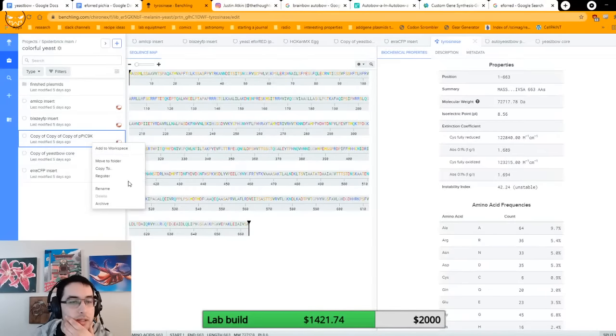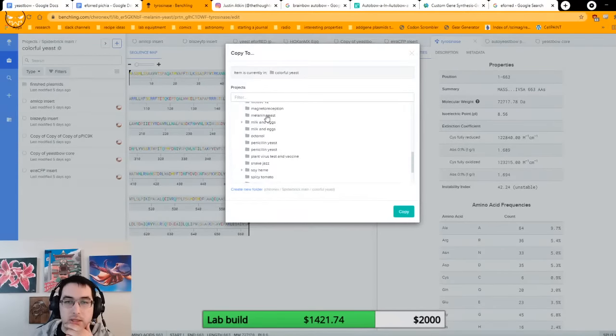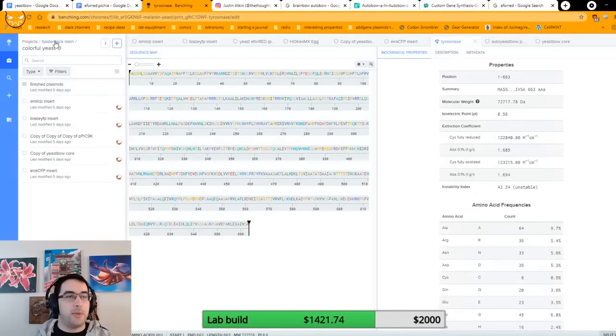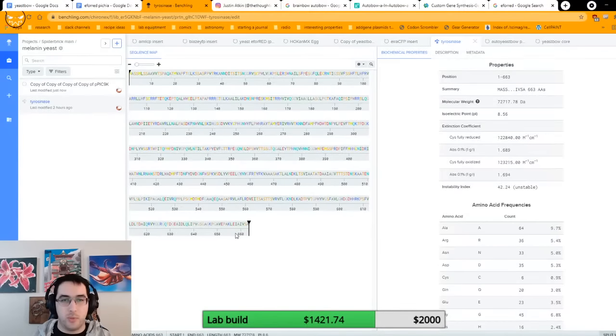So I'm going to copy this backbone to melanin yeast. There it is. Copy. Lovely. Now we're going to go over to melanin yeast, which should be here. Cool. We now have the two things that we're going to need. Okay. Thank you, Ember Beast, for the suggestion.